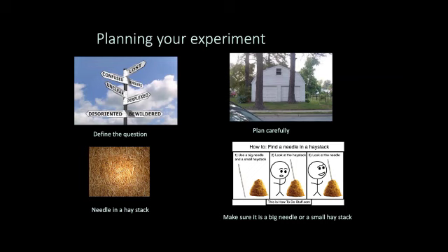And also, remember you're cutting a section of a cell, so on one section you may have 100 different sections of different cells in there. When you add it all up together, it's really just representing one full cell. So you want to plan carefully that what you're looking at can be compared and contrasted to things that you know what they look like.